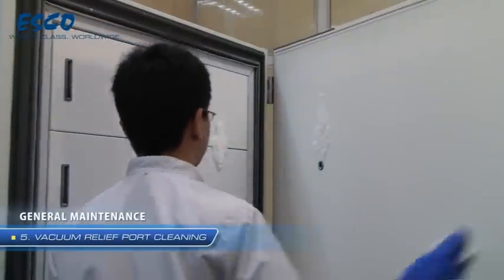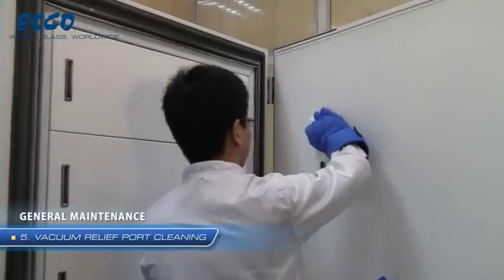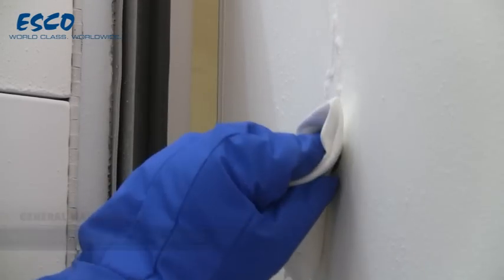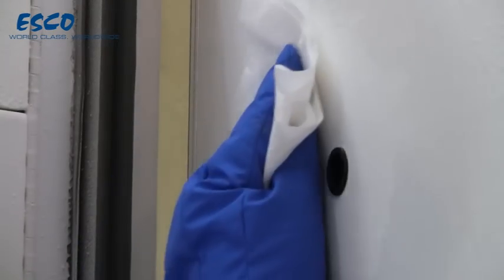Use a soft cloth and remove any frost buildup from the vacuum relief port located at the back of the main door. Cleaning of the vacuum relief port should be performed regularly depending on how often and how long the door is open.